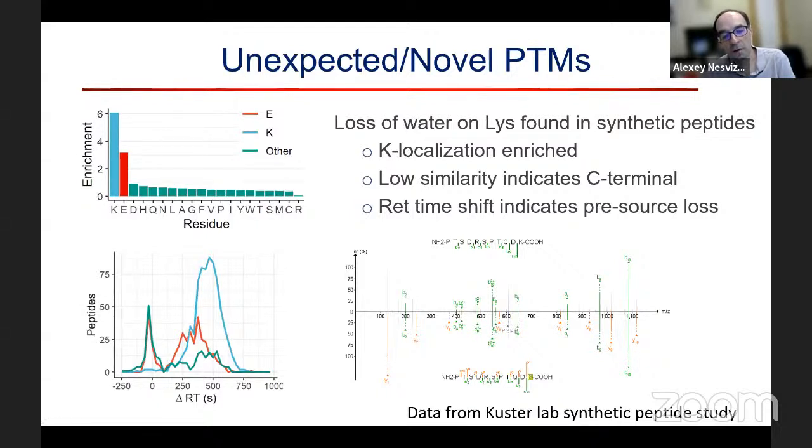This is a very interesting, unexpected byproduct of peptide synthesis that I think people should be aware of. And tools like FragPipe with MSFragger and PTM-Shepherd allow you to identify this type of event and sort out which are neutral losses and which are modifications that happen prior to mass spec.